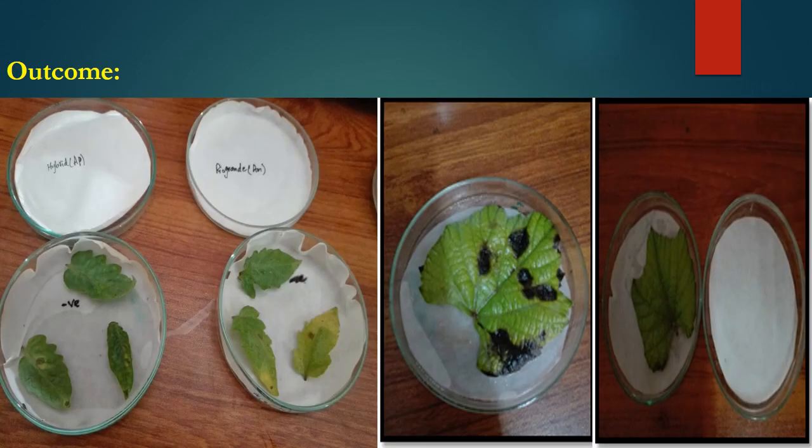Here is the outcome of the leaf detach method. In the case of the tomato plant, those leaves inoculated with the bacterial culture first become yellow and later become necrotic. Those leaves inoculated with sterilized water — the negative control — remain green despite high humidity, with the petri dishes placed in an incubator at a temperature favoring the pathogen. On the other side, the grape leaves on which fungal spores were placed become black and die, while the leaf treated with sterilized water remains green.